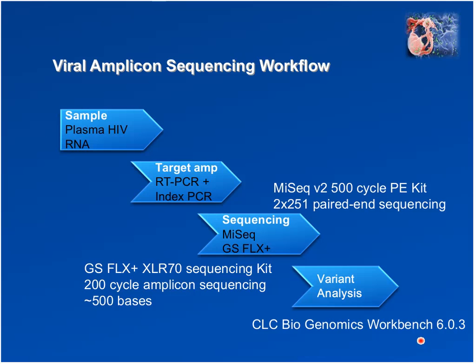if you recall, in this case, we looked at 48 amplicons from 48 different specimens. So you can basically say that we looked at 48 samples on each platform for each run. On the MiSeq, to generate that data for 48 samples, it costs us approximately $1,500.